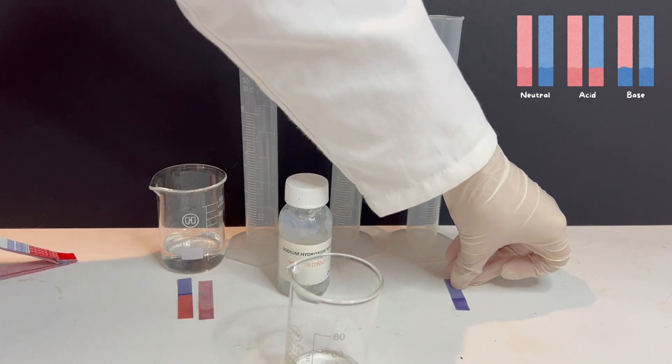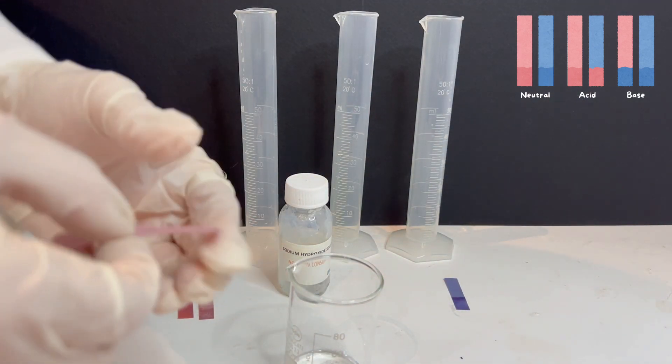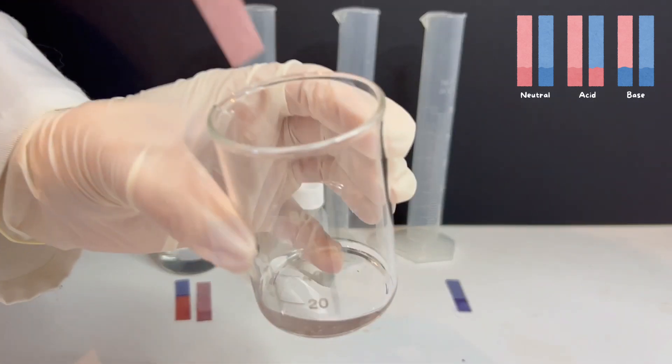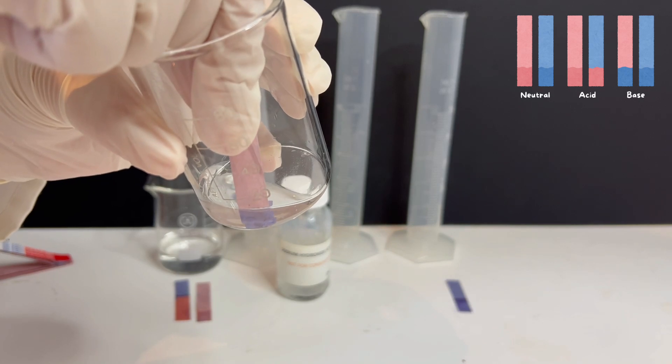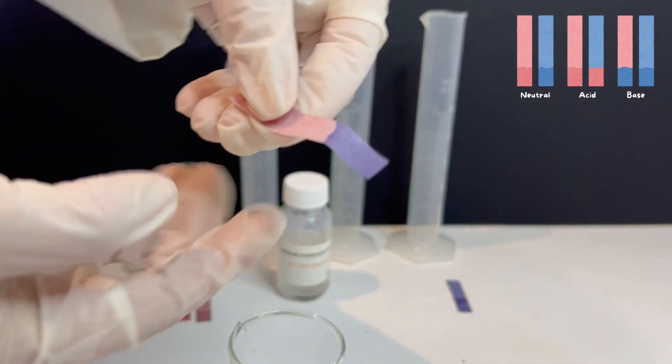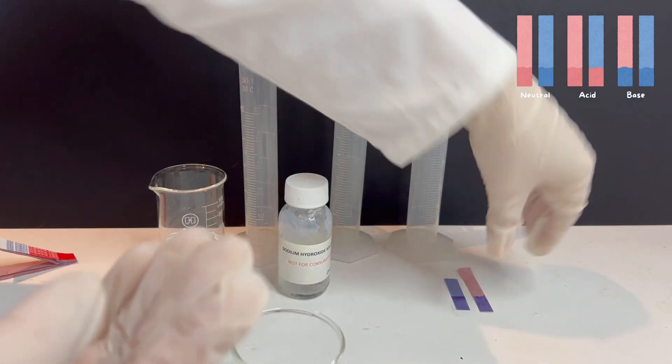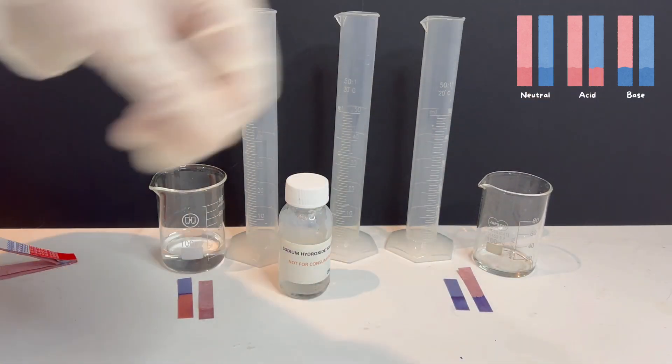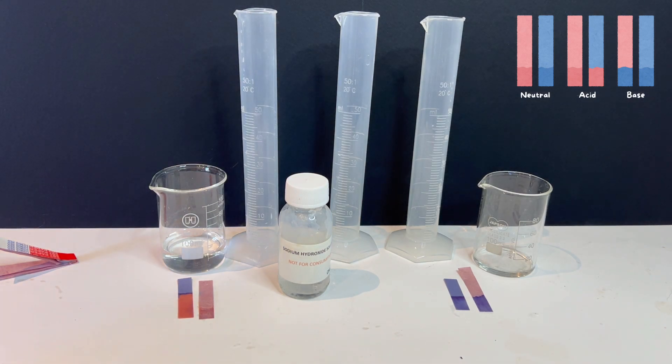Now, I dip the red litmus paper into the sodium hydroxide solution. This time, the red litmus paper turns blue. That confirms that sodium hydroxide is a base or alkaline substance. Bases produce hydroxide ions in water, which reacts with the dye in the litmus paper and change its color to blue.